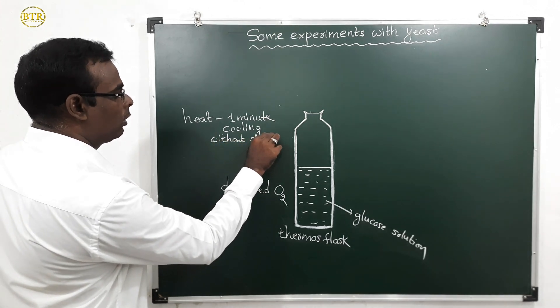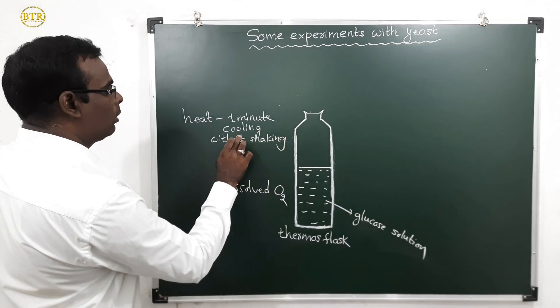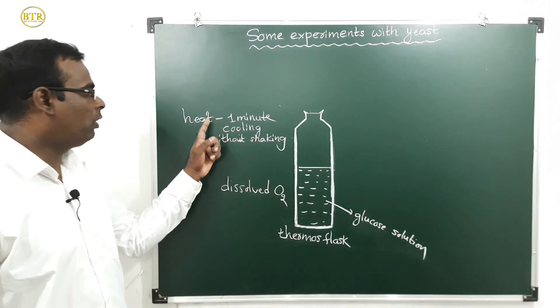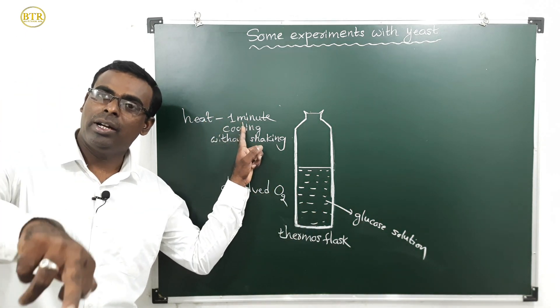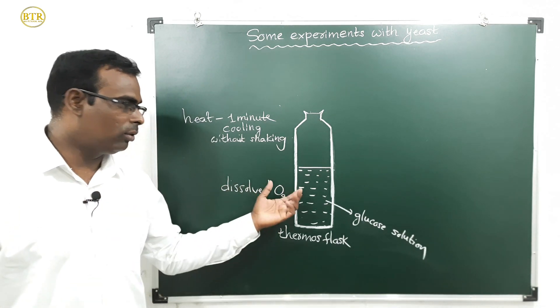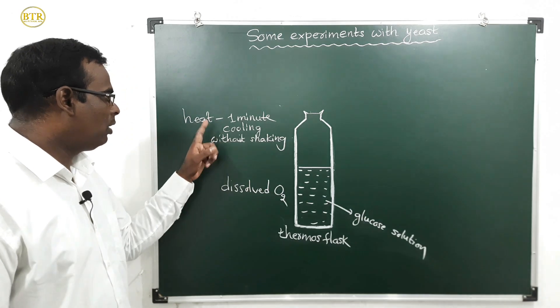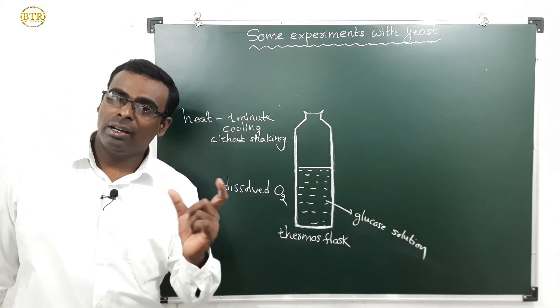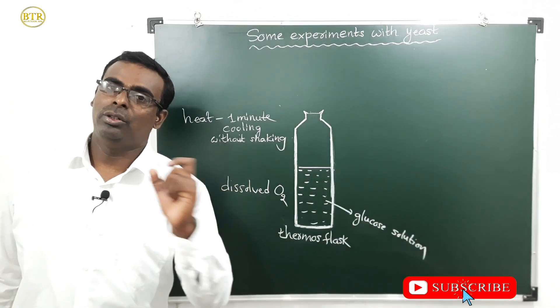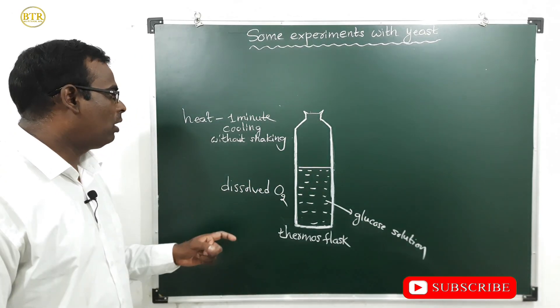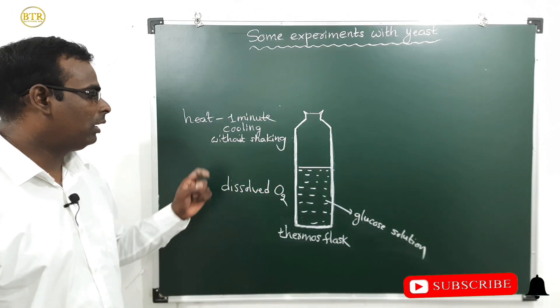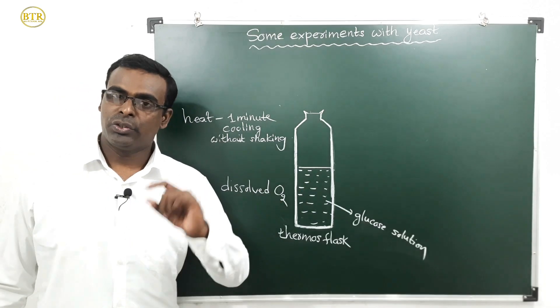Cool the glucose solution without shaking. You may still wonder if oxygen remains in the solution. To check this, we use a technique: we add a dye to confirm oxygen has been removed. When you cool it without shaking, dissolved oxygen is removed from the glucose solution.